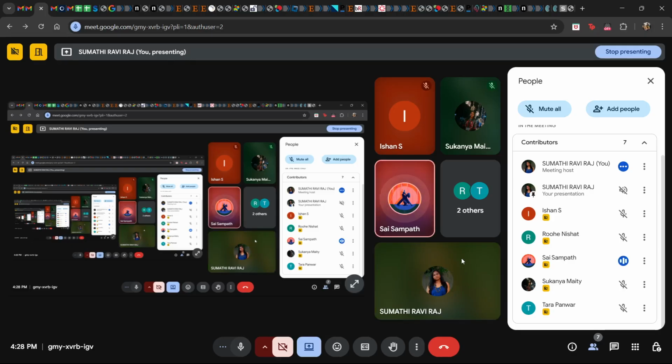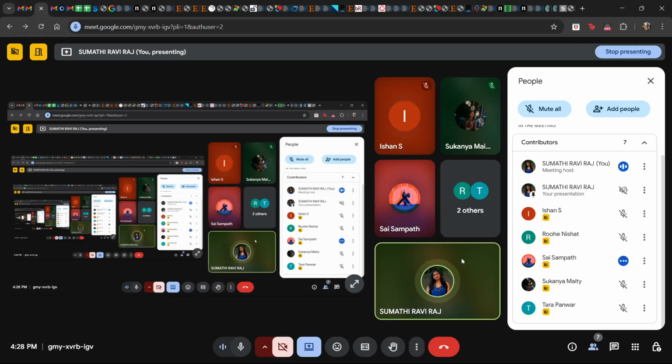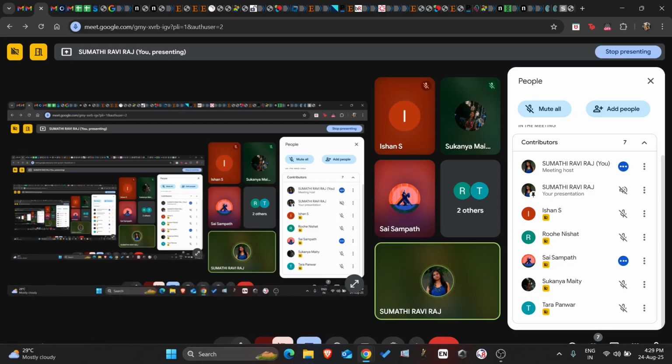Ma'am, with gel filtration chromatography, can we know the molecular weight? Yeah, you can know the molecular weight because you have to run a standard. In the standard, you will have some proteins whose molecular weights you already know, like albumin or trypsin or chymotrypsin. These are all known molecular weight proteins. So when you run that, you will know in which fraction each molecular weight is coming. Then, when you later run your sample, if your sample also comes in a similar volume, based on your retention time and your KD value, you can calculate it.